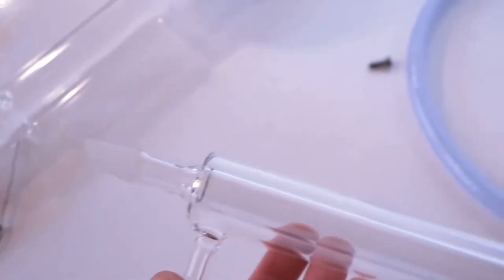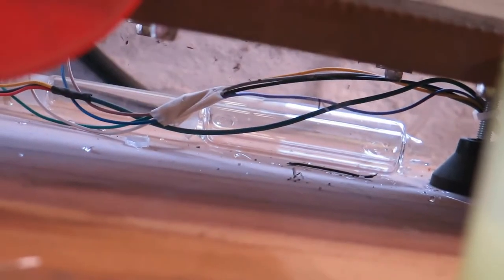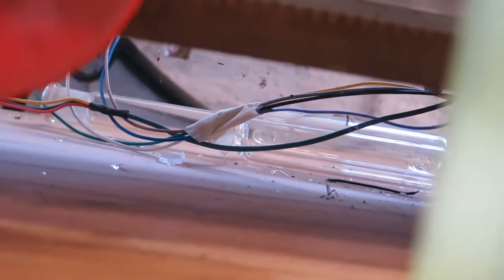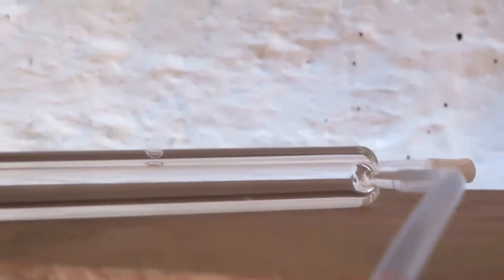So I broke one of these condensers, so I have to make a new one. Well, actually, I broke this one as well. This was the long one. Well, long and short. So I had to make one of these, and I made two. And I think I got pretty good at this.